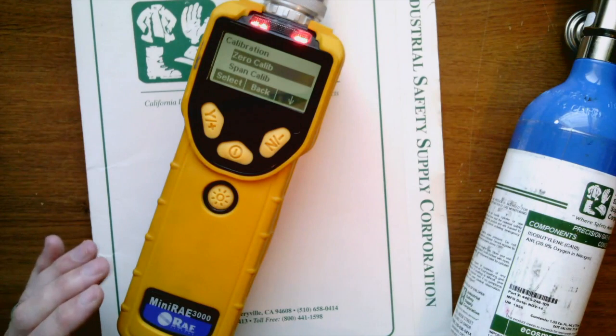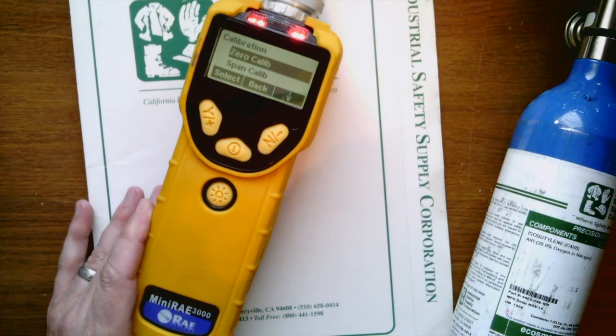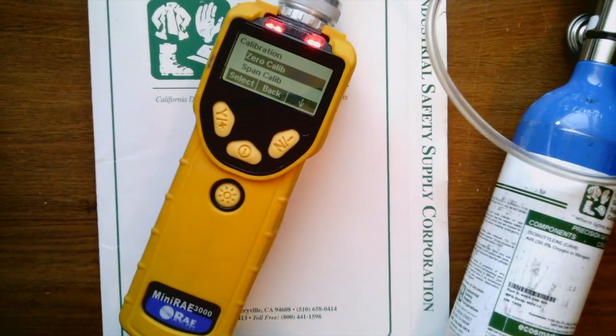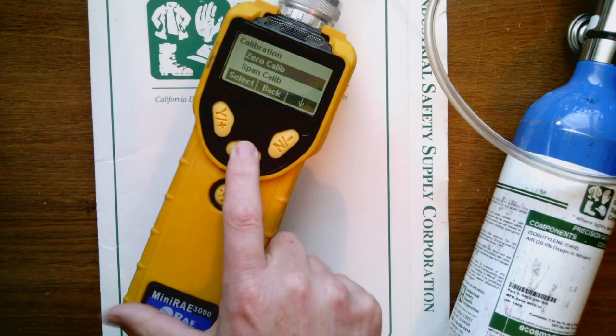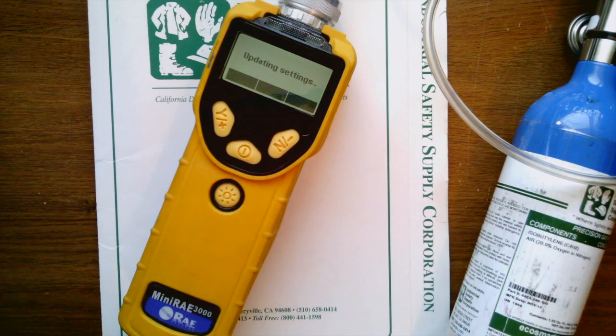All right. After the span calibration is done, you can see that it goes into its regular mode. I'm going to go ahead and pull the gas off. We'll go ahead and go back and back again, and as soon as that runs down, you'll now have a freshly calibrated piece of equipment.